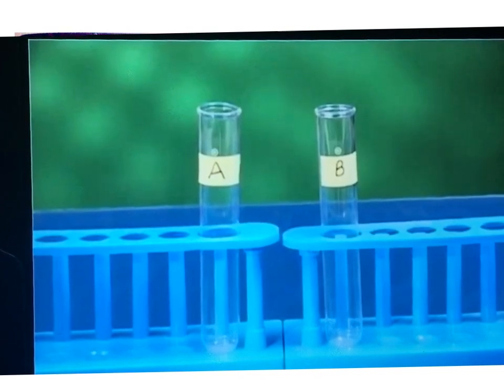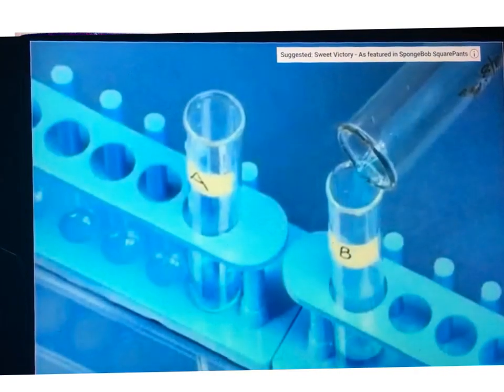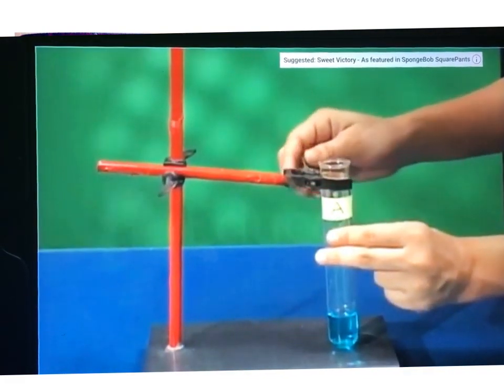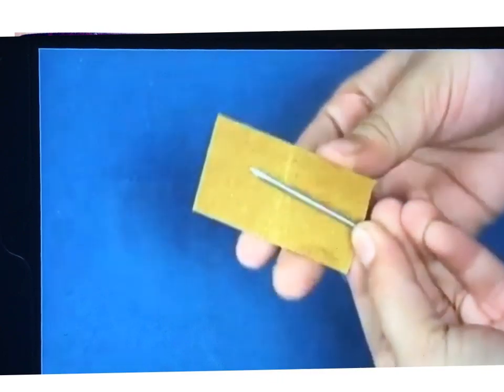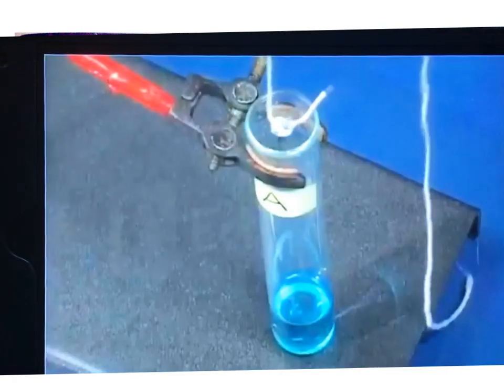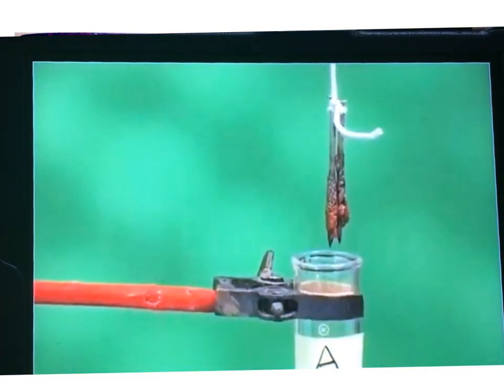Take two test tubes marked as A and B and in each test tube pour about 10 ml of copper sulphate solution. Fix test tube A on the clamp stand and keep test tube B in the test tube stand. Now take three iron nails and clean them by rubbing with sandpaper. Tie two iron nails with a thread and immerse them carefully in test tube A for about 20 minutes. Keep the third nail as it is. After 20 minutes, take out the nails and keep them beside the third nail.